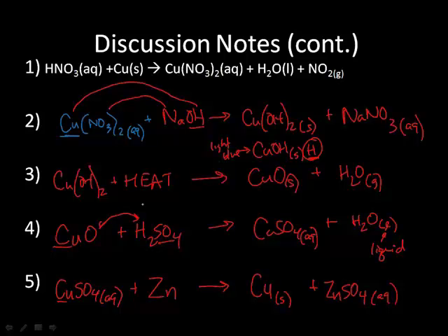So you can see here what is happening in this step is our copper and our zinc are switching places, so to speak, and the zinc is going into solution and the copper is coming out of solution. In this particular last step, it's possible that some of you actually got a bluish colored solution. This here would be referred to as a source of error.